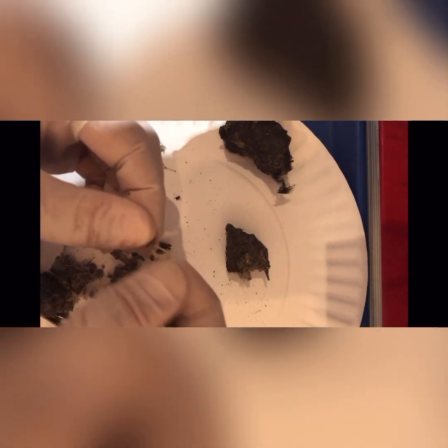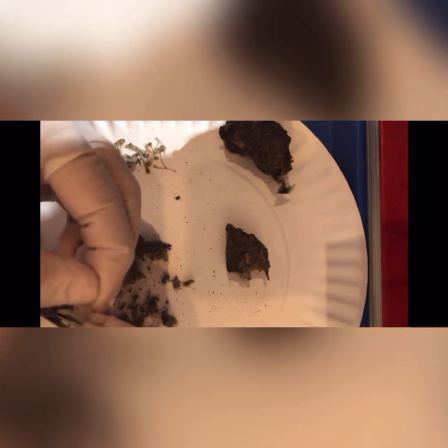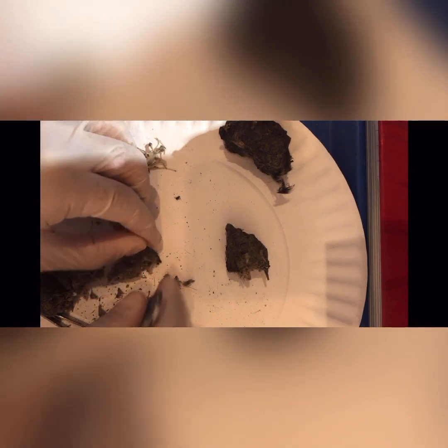So my owl ate its prey, swallowed it whole, and none of the bones broke while it was eating, while it was regurgitating. You guys know what I told you, the definition of regurgitation. The definition is to bring up swallowed food back to the mouth again. So that's not really creating waste, right? Some people think that when owls regurgitate, that's their waste. It's not their waste. They do produce waste just like other animals do.